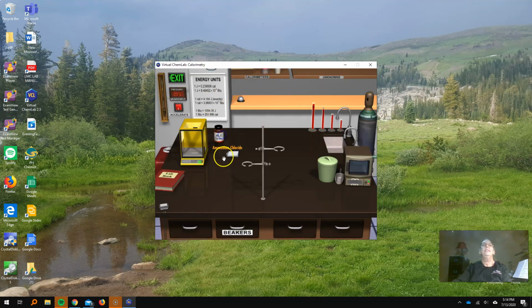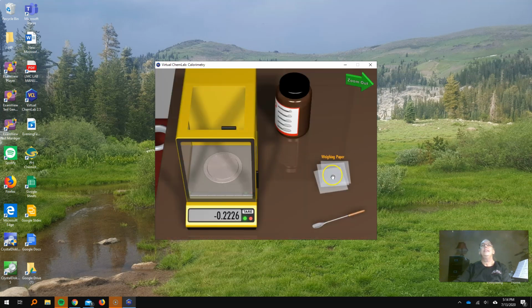Take you over here. Let's put some weighing paper on there. Let's tare it so it's 0. Open it up. Grab some good ammonium chloride. Put it on the balance. So you're going to write that mass down. I am too, so we have the same answers. 0.9867 for ammonium chloride, NH4Cl.